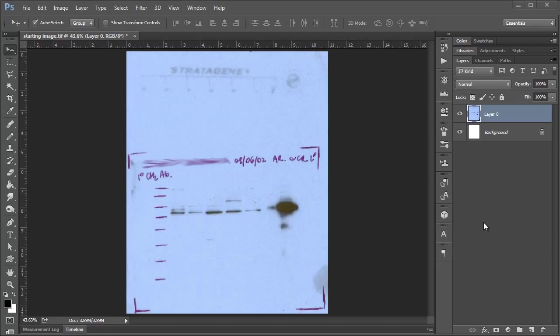What that is going to allow us to do is hide the parts of our image that we're not necessarily interested in keeping in our figure, but at the same time will save us from deleting any pixels, which may be important later on.